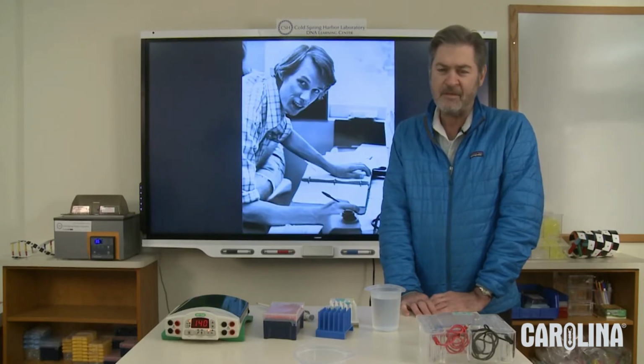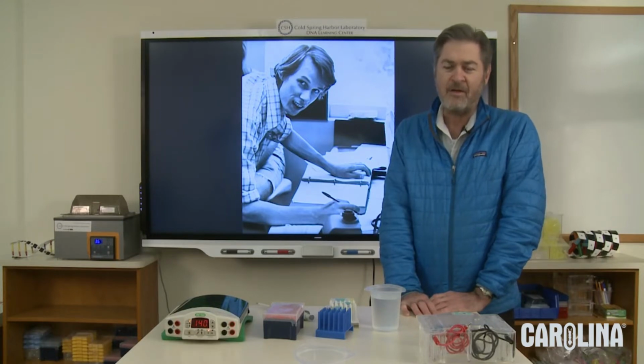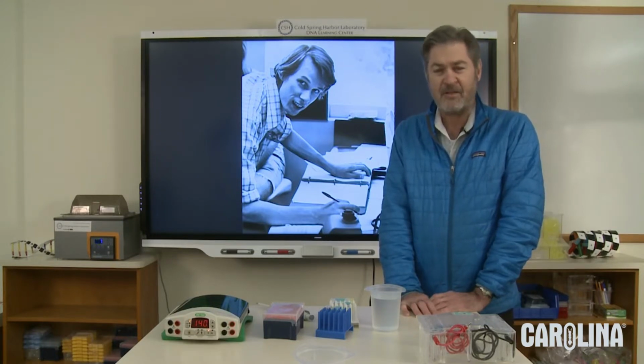But it's important also to know that this experiment came from the home of molecular biology, and in particular of the restriction enzymes that you'll be using today. At the time I developed this experiment, I was working in the lab of Rich Roberts. Rich Roberts, here he is at that time, went on to win the Nobel Prize in physiology or medicine for techniques that he later did at Cold Spring Harbor.